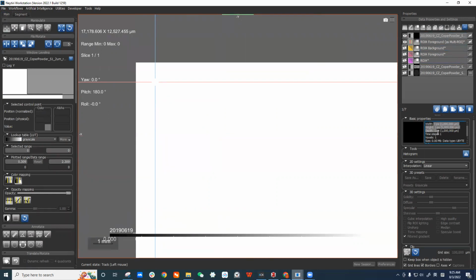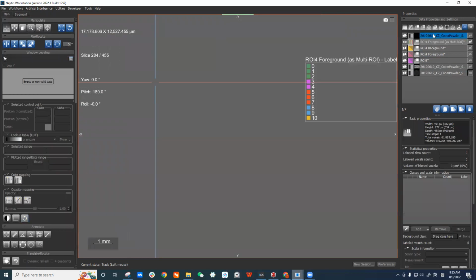You see the size. So the macro is not working properly for this step, which is the step for creating the landscape for watershed, which is the Sobel filtered image. Of course, if this step is wrong, the next step, the multi ROI, is also wrong.